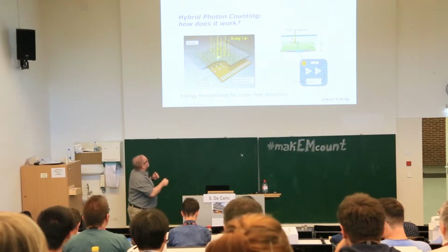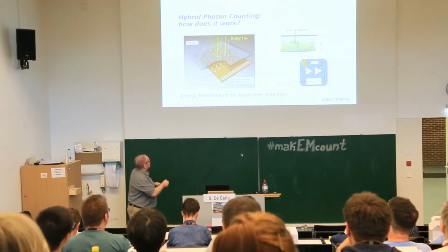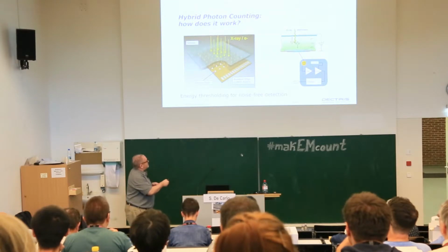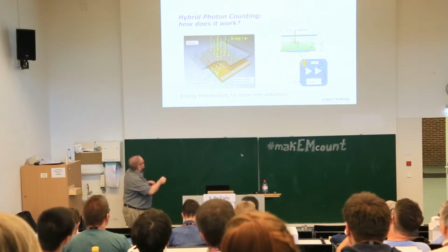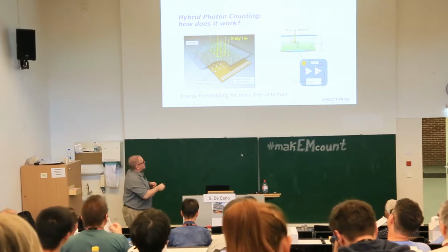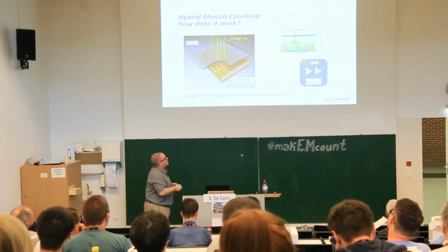A sensor, a continuous sensor, which is sensitive to charged particles, so X-rays and electrons, you can see here as well. And underneath you have the readout chip. This is CMOS-based. ASIC stands for Application Specific Integrated Circuit. Here you have the periphery where the signal comes out, and the contact between the sensor and the readout chip is an indium ball, which is represented here by this bump bond or bump pad.